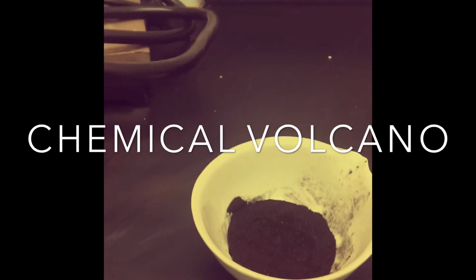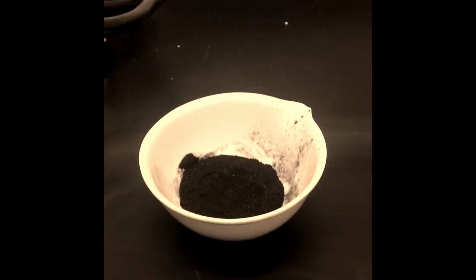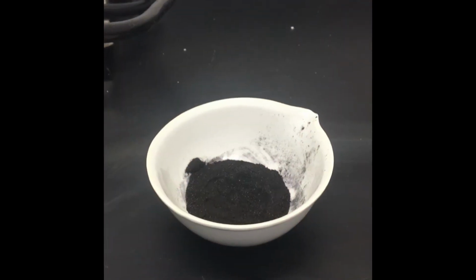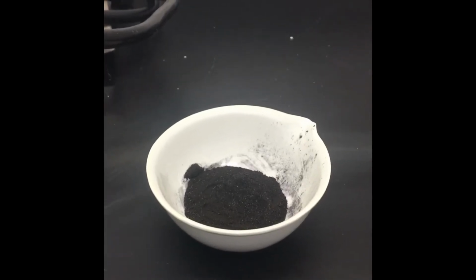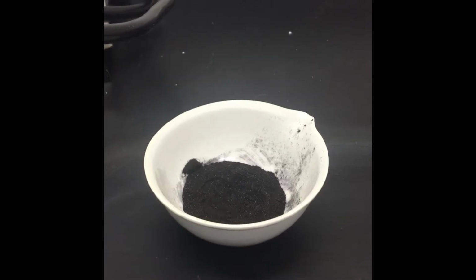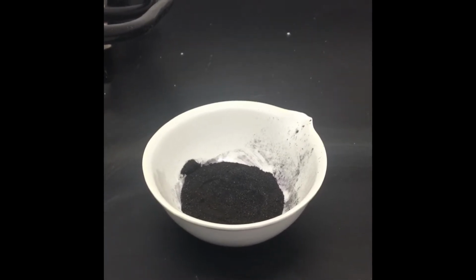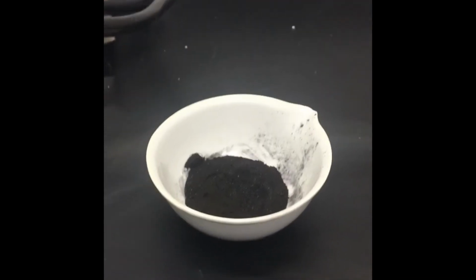Okay, so now let's look at another reaction. This is actually called the chemical volcano. So what we're going to do, similarly to what we did with the gummy bear, is see if we can create an explosion by not necessarily adding any fire. We're going to actually produce that. And sometimes this is shown as part of fireworks or flames. We'll see how it actually looks.